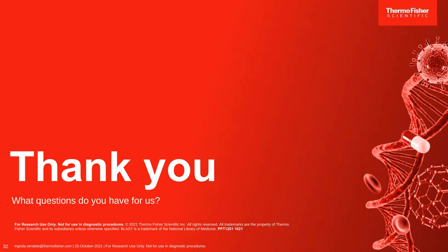Great, thank you. Next question. What RNA isolation kits are compatible with RT-LAMP solutions from Thermo Fisher?